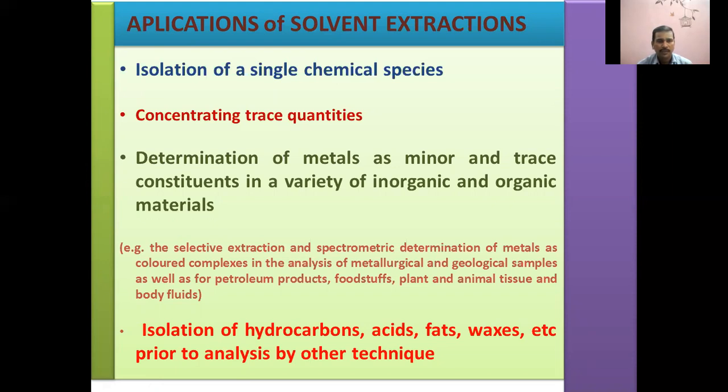Whenever batch extraction is not possible to use in order to quantitatively extract the solute, either by doing single extraction or multiple extractions, we may have to use continuous extraction. So continuous extraction is always advantageous whenever we want to extract the solutes in minute quantities.